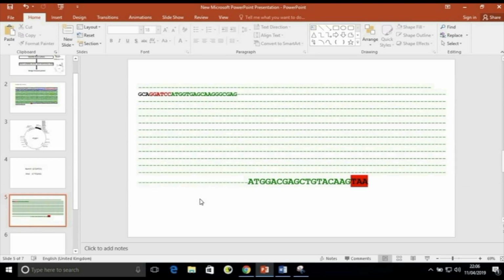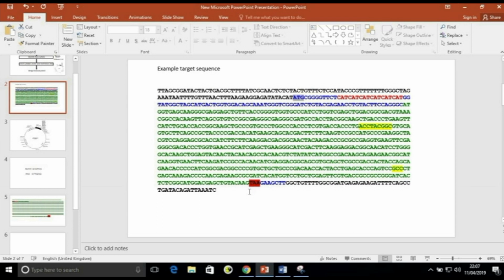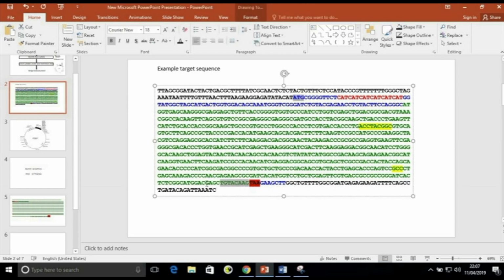But in case of the reverse primer, it is somewhat difficult, not in terms of predicting things, it is somewhat tricky. So what I'm saying is, here we have the sequence. In case of the forward primer, we just take an as-it-is sequence, 15 to 20 bases from the sequence itself.